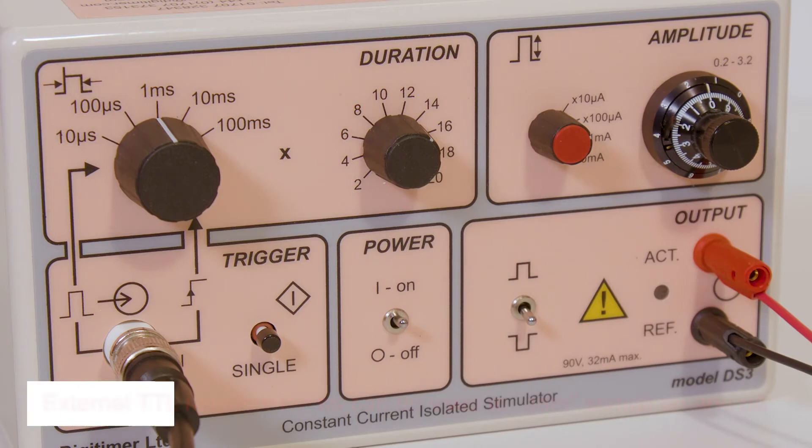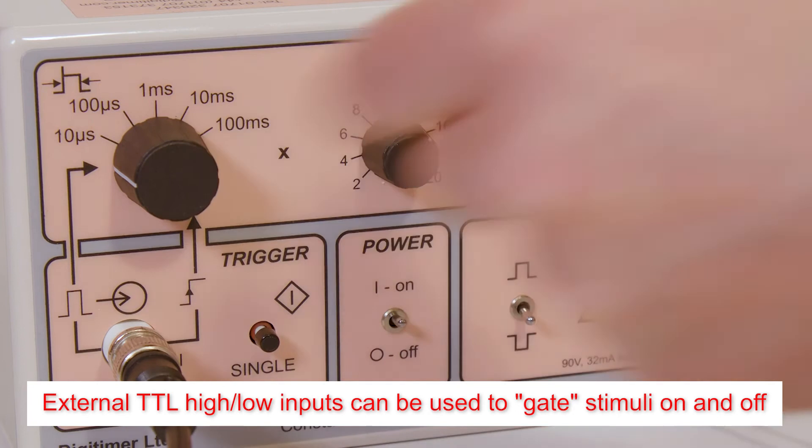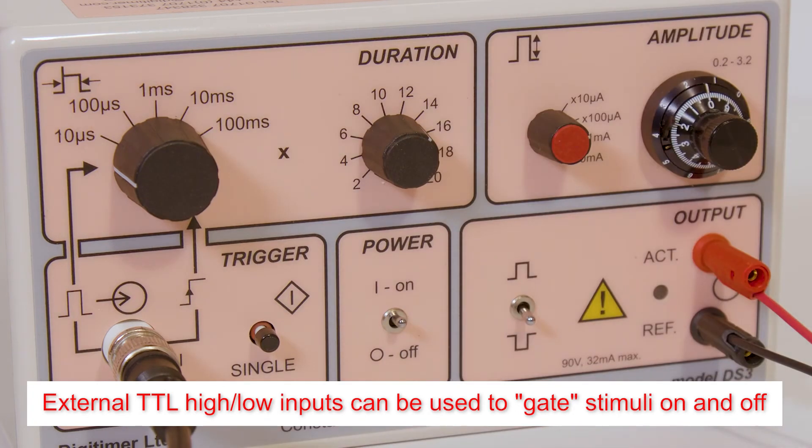By adjustment of the pulse duration switch, the duration of an external TTL compatible pulse can be used to gate stimulation on and off. This is of particular use if stimuli longer than 2 seconds are required.